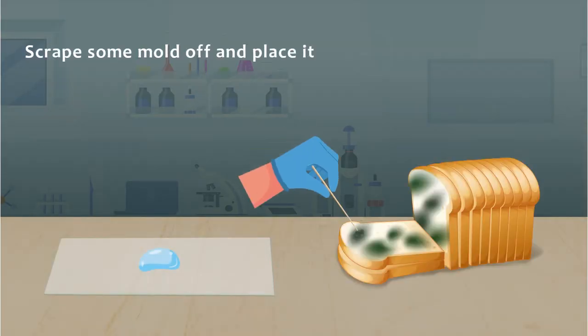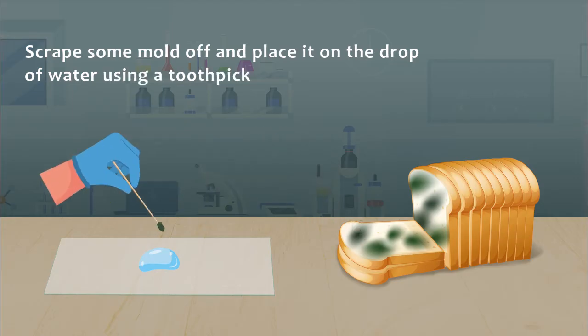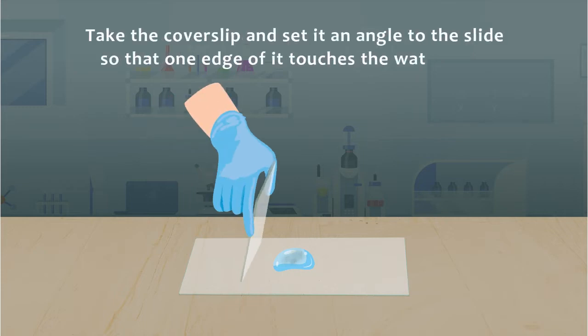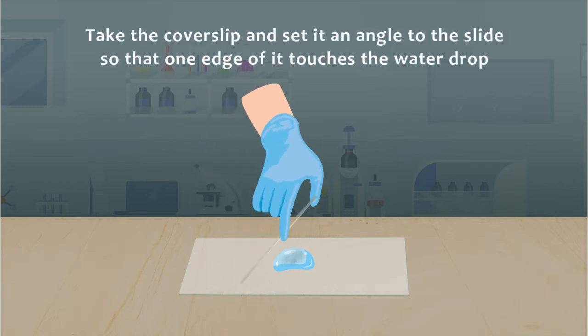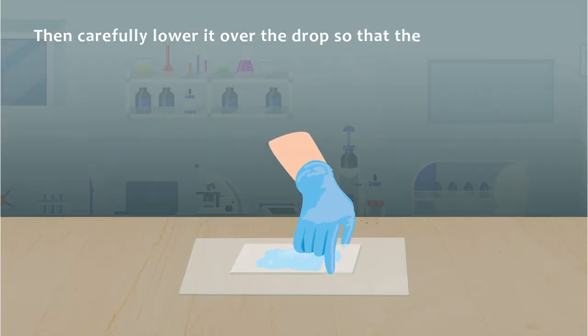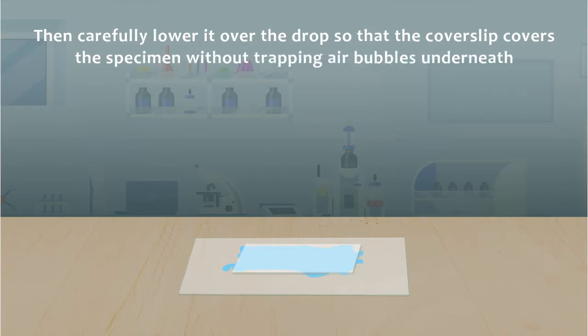Scrape some mold off and place it on the drop of water using a toothpick. Take the coverslip and set it at an angle to the slide so that one edge of it touches the water drop. Then carefully lower it over the drop so that the coverslip covers the specimen without trapping air bubbles underneath.